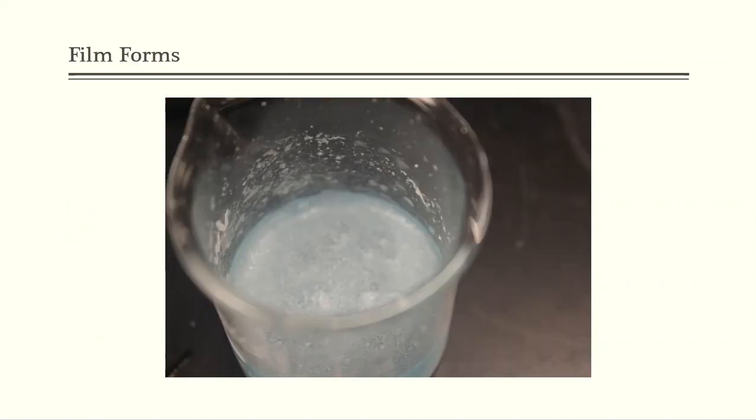As I set it on the countertop area, this benzoic acid immediately began to fall out of the solution. And this is a good thing, because benzoic acid should not be as soluble in room temperature water or colder water, all right? It's really soluble in hot, but in cool water, this stuff is going to fall out.